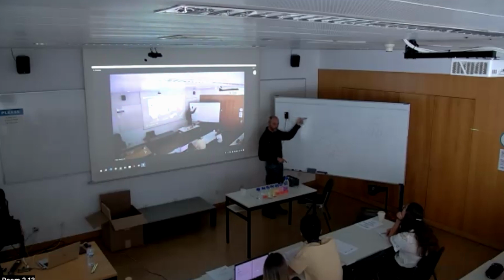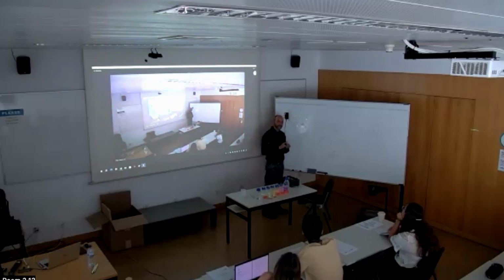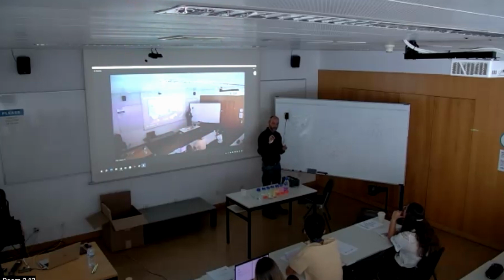It is truly slowing down, then it accelerates again, but the angle of incidence is 90 degrees, so it's perpendicular with respect to the surface of separation. That's why I told you that there must be a difference in the refractive index between the two, but it's also important that the light is obliquely traveling through the surface of separation, because it's also dependent on the angle of incidence.